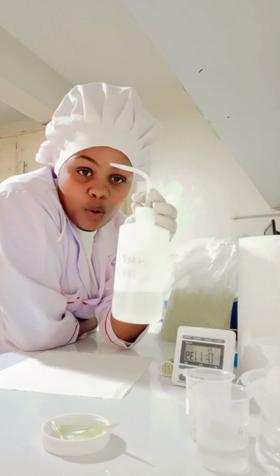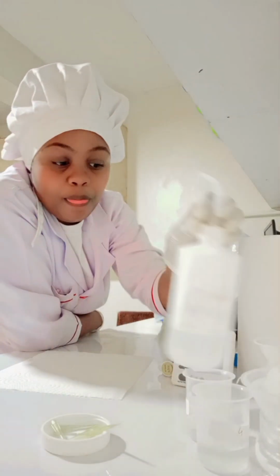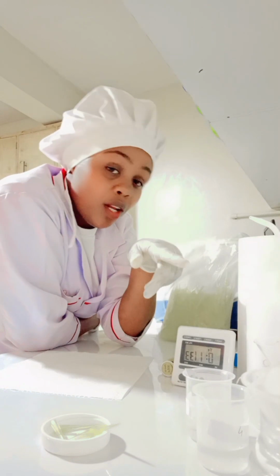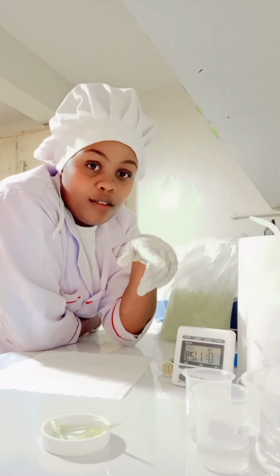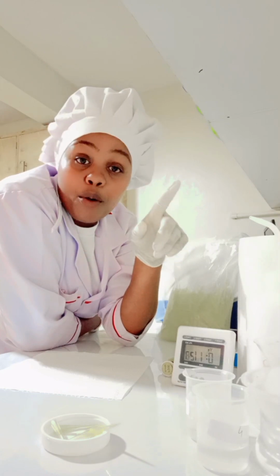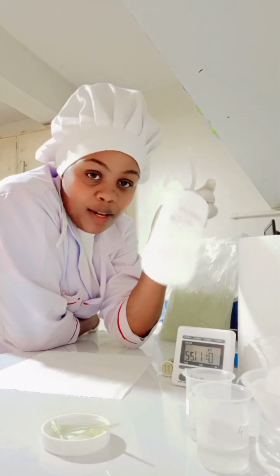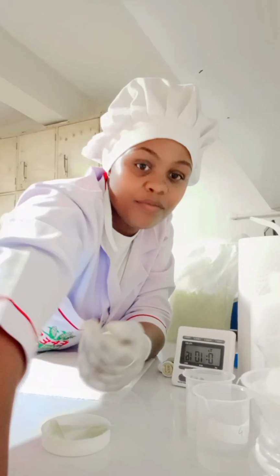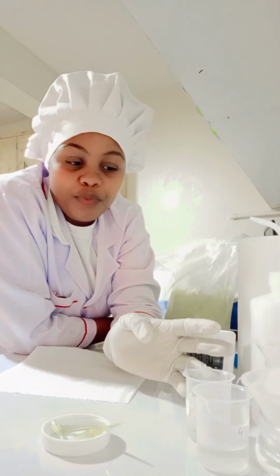Nilikuwa nasema this is not water, like most of the people may think when inakaa clear inakaa maji. That's why people are being told don't eat or drink anything in the lab. So I think that's what I was explaining. It's prohibited for you to eat or drink anything in the lab. Okay, what was I saying here?